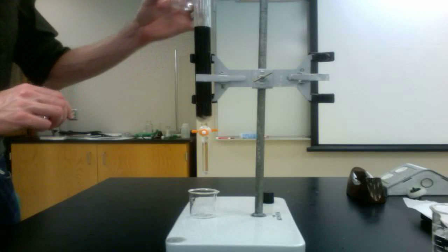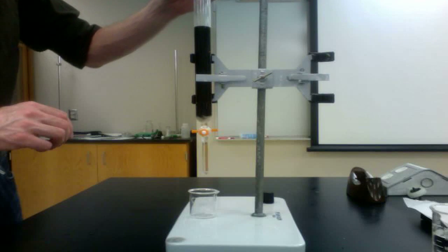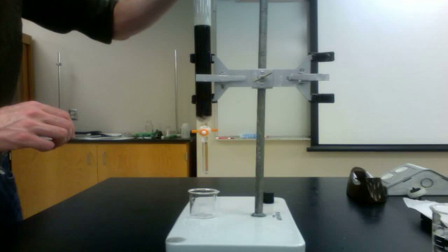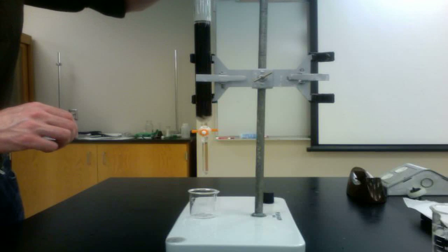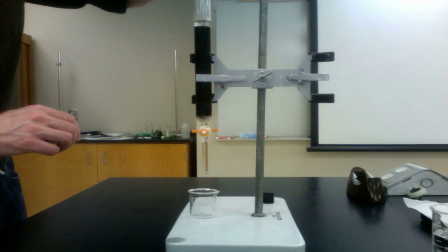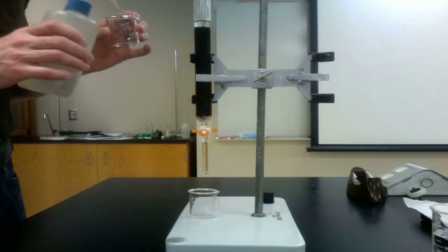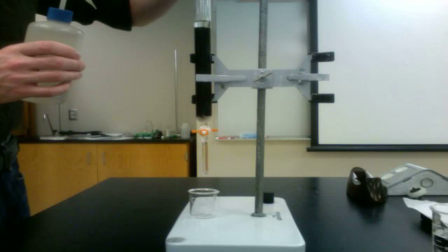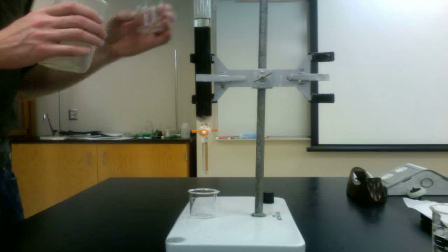Lower the level of water in the column to the height of the resin before you add the salt solution. Carefully pour the solution in order to minimize the disruption of the resin as it is added. It is crucial that every drop of solution be added to the column, so rinse the beaker and add the rinse to the column. Repeat this several times.